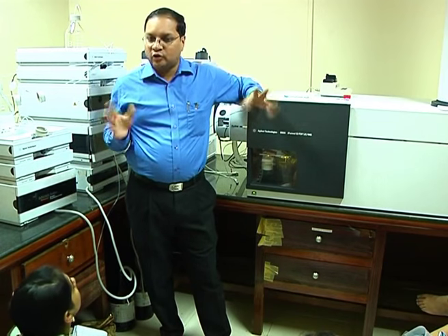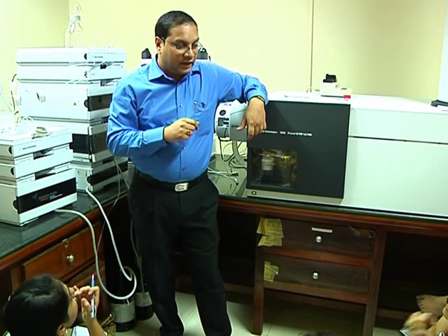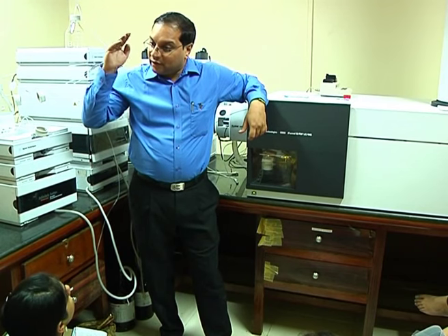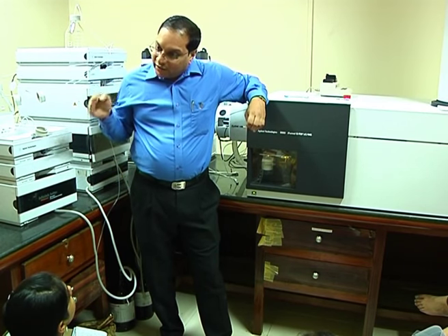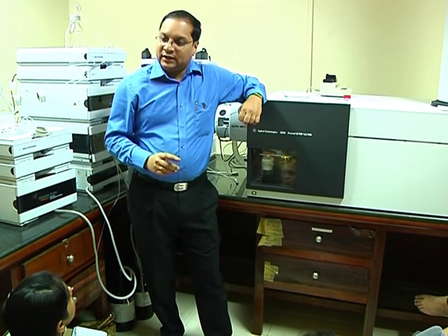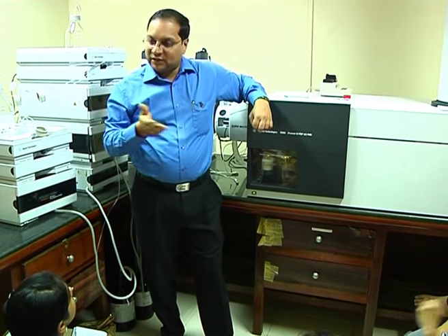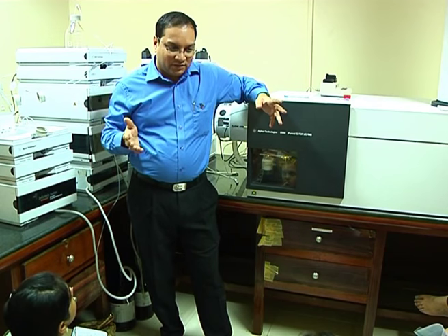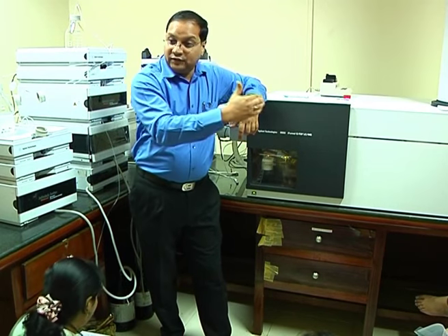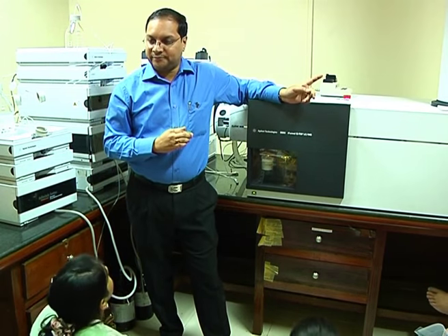So what to do next? I don't know which out of these 50 peptides is correct. But the moment you put time of flight, 500 becomes 500.12345, and the fragment of 500.12345 becomes 10 different fragments of accurate mass. So it is absolutely unlikely that a peptide of a different sequence gives the same MS pattern with different masses. So the match will be absolutely perfect. You started with nowhere, you ended with somewhere which is reliable. That's why we need time of flight.